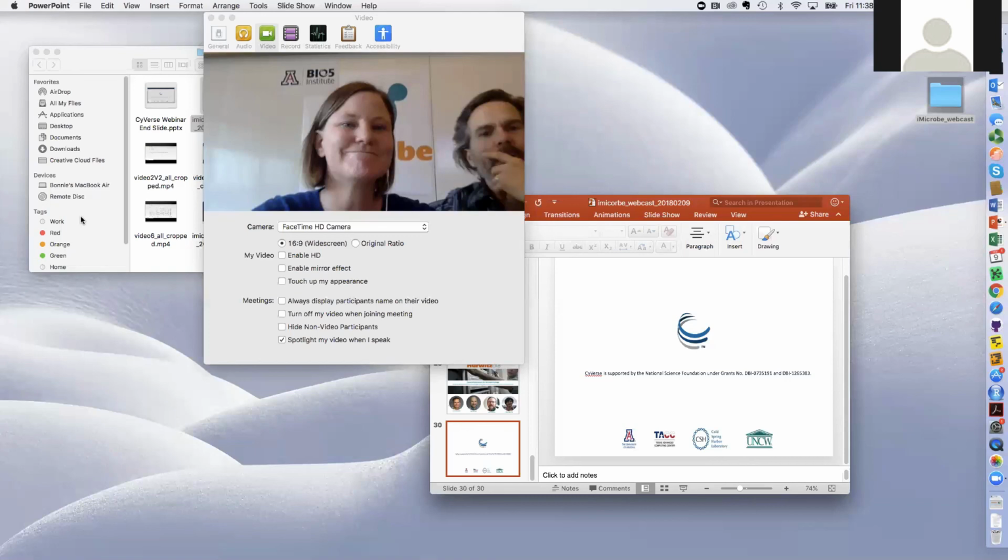Yeah, and I should also say that we're interested in developing different pipelines that really drive some of the analytics on the site. And so you saw from the webcast that we are annotating all of our data sets for taxonomy and for various proteins with KEGG and Pfam. That kind of information is incredibly useful for trying to compare and contrast your data with various data sets that you might match to within iMicrobe. And those pipelines we're making available as apps as well.